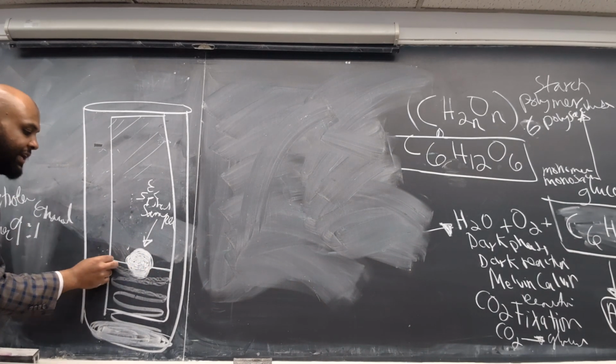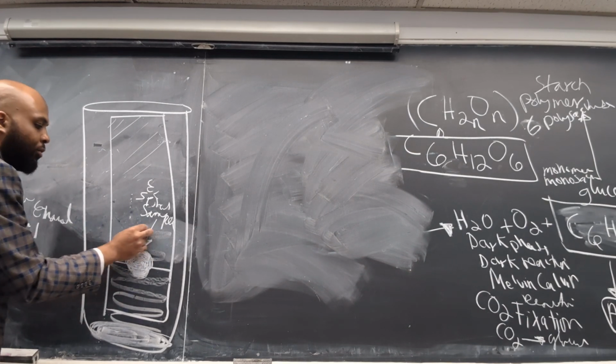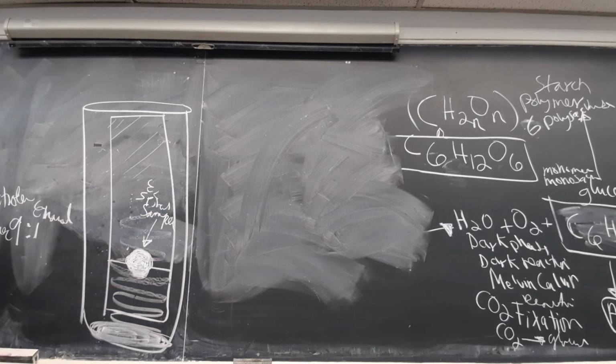Then the solvent is going to continue moving up, and our pigments are going to start separating based on molecular mass, based on size. So the smaller pigments are going to move very easily and very rapidly, and they're going to move to the front, while the heaviest and the densest pigments are going to stay behind. They're going to stay in the back.